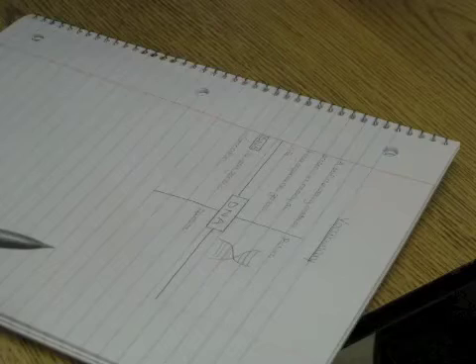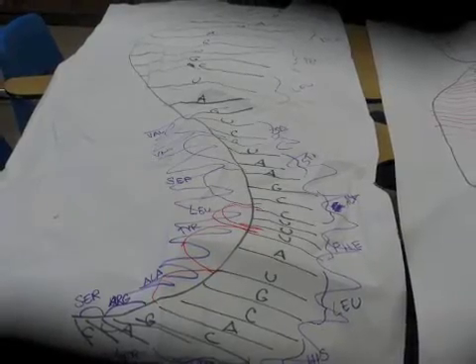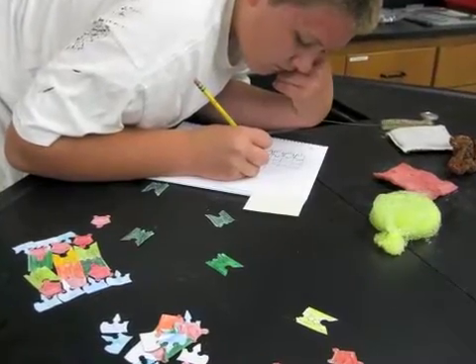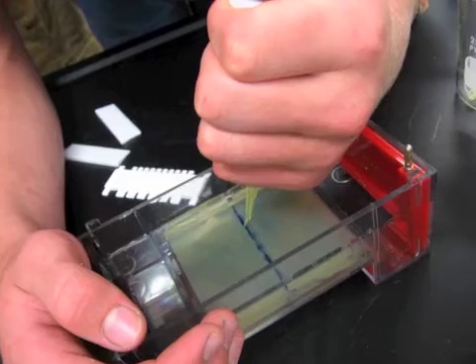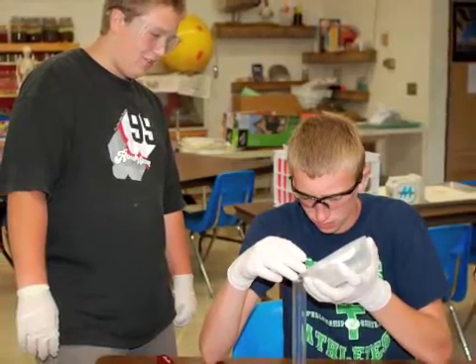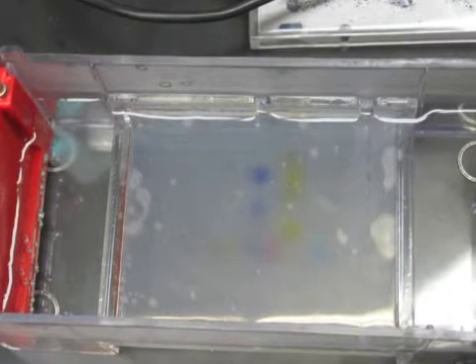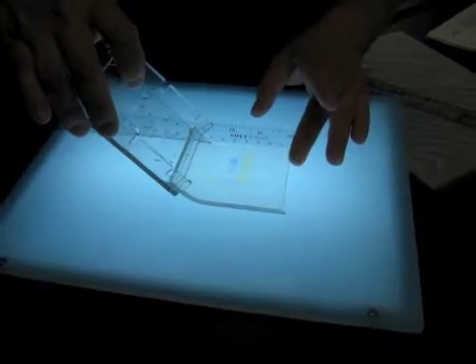We started the class because we weren't able to cover applied genetics in a biology class, so we decided to start with what they already knew about the cell, DNA, RNA, and proteins, and then we started doing some hands-on lab activities. Specifically, we had 4 different lab activities. The first one, they learned how to genotype using gel electrophoresis. Secondly, we learned how to do polymerase chain reaction using gel electrophoresis. They really liked that one.